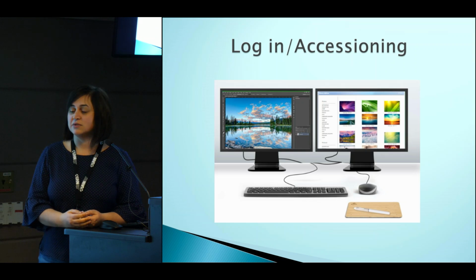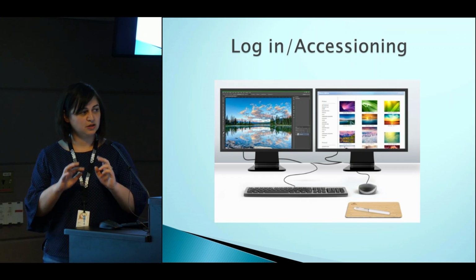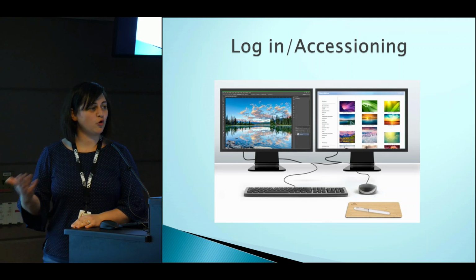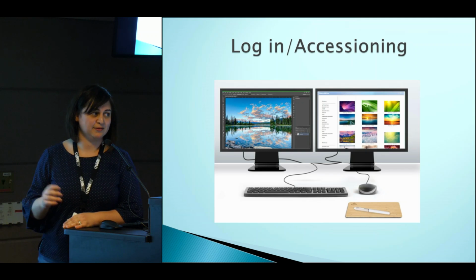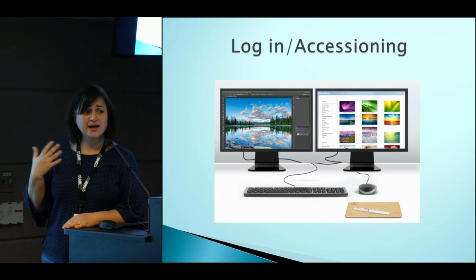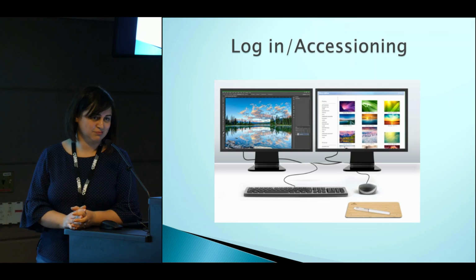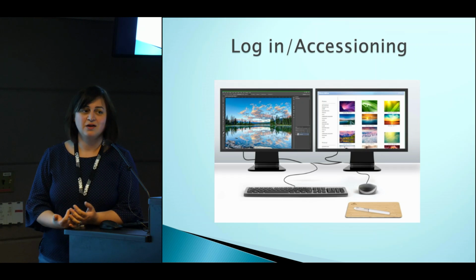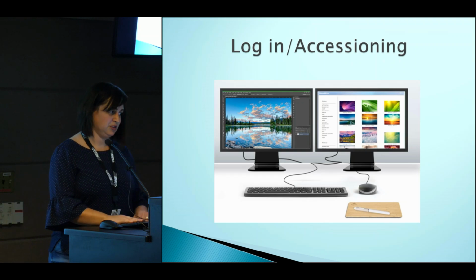So now the technicians can just go into the login book digitally, enter all the data, and they'll do that on one monitor. On the next monitor, they'll have CoPath open, and they can just directly enter all the necessary data for that sample into CoPath. And this also allows us, at the end of the year, before we used to actually scan all the login binders into the system, because we have to keep that information, and we don't have to do that anymore. It's just directly in there. It's secure because it's password protected, and it's also recoverable because it's on the UHN network. So no loss of data, basically.